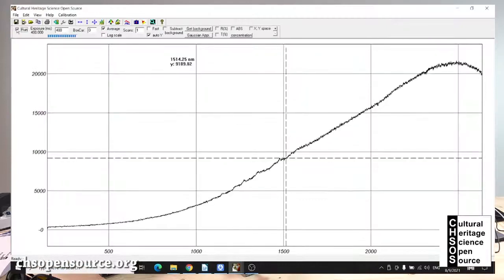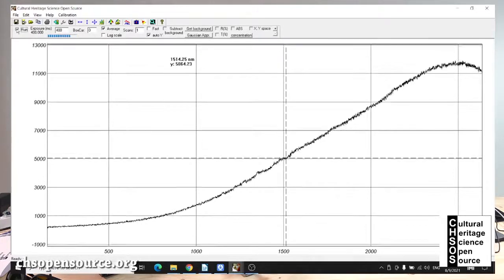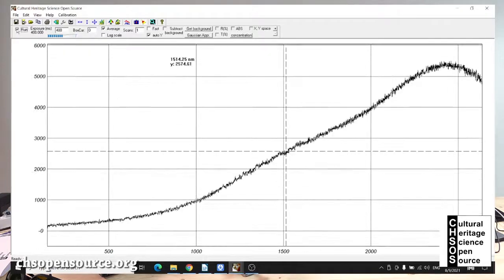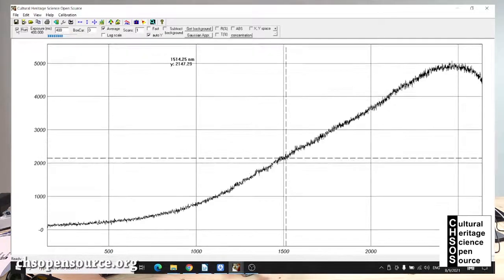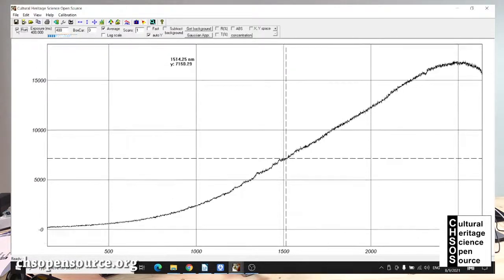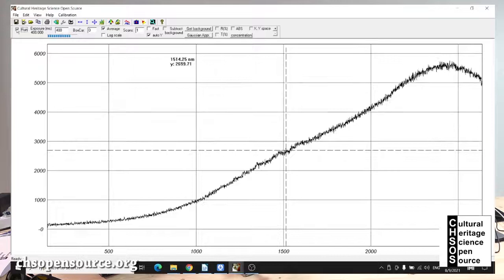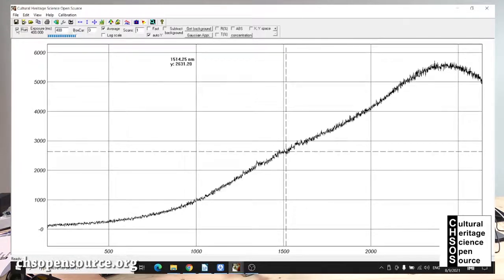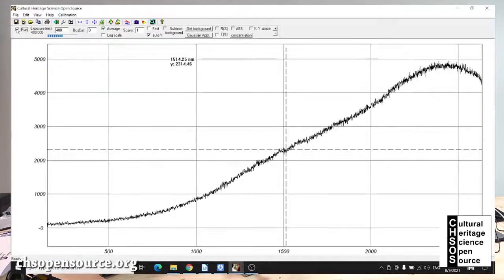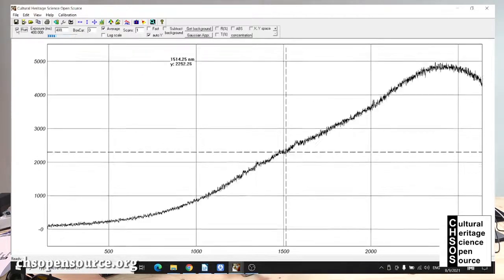Okay, I keep moving the slit, so I'm closing, closing, closing. You see again now the maximum is 11,000, and now I close almost totally, so there we are. Okay, now here I close totally the slit. So the maximum you see is just 5,000. So it's very low, this maximum. So it means we can put much longer exposure and see if we actually can raise the peaks.